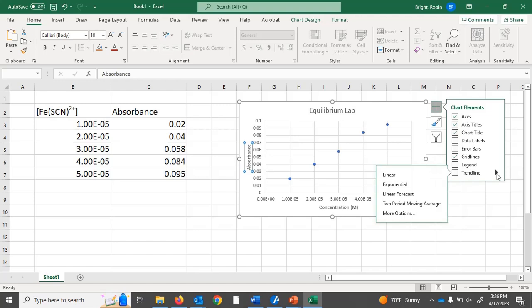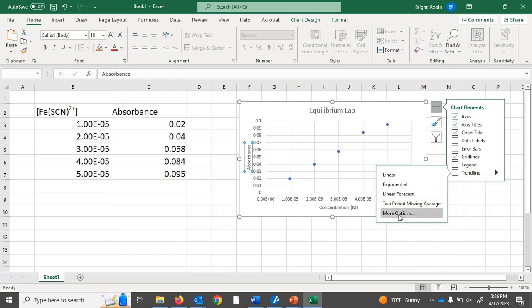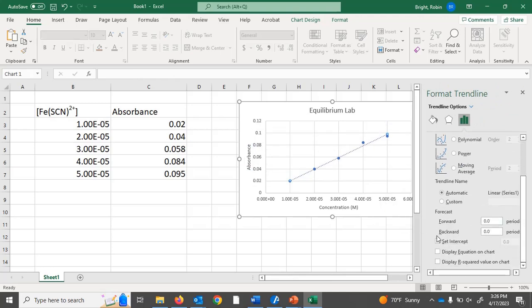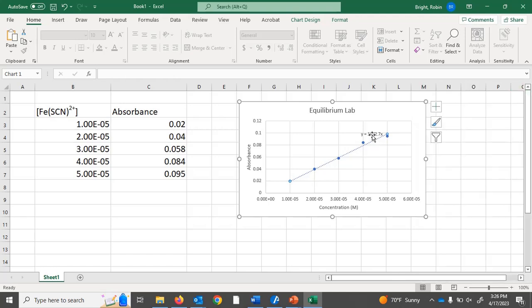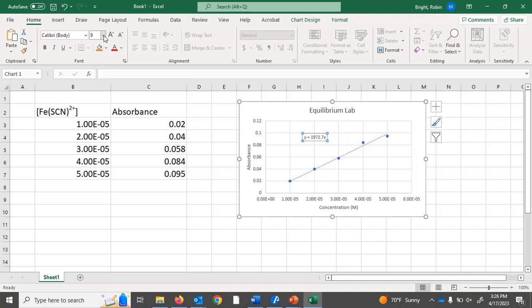And of course the most important thing is the trend line. Just like the last time, I'm going to come down to the right. I want to go to more options. So down the trend line to this little arrow here, and then when I click the arrow I get more options. I want to scroll down. I want to say I want to set the intercept at zero, and I want to display the equation on chart. If you don't set it to zero, it's going to give you a more complex equation than this and you really don't want that.